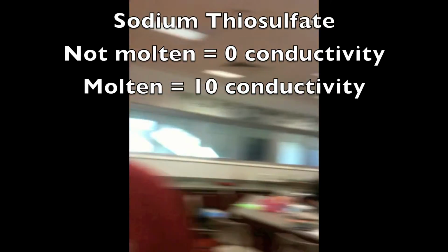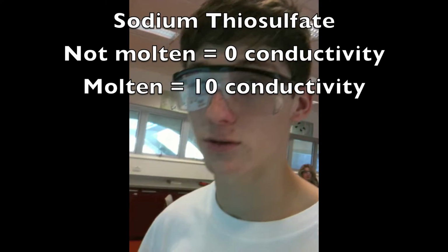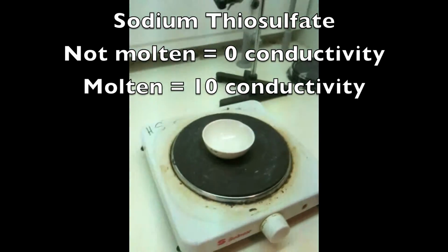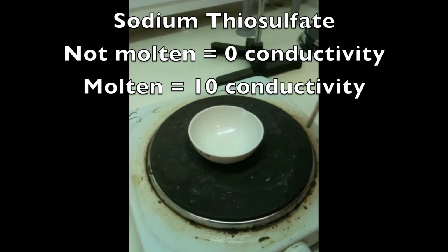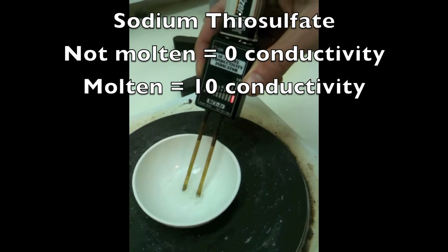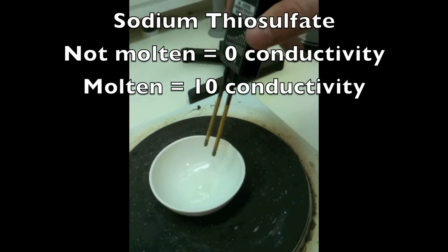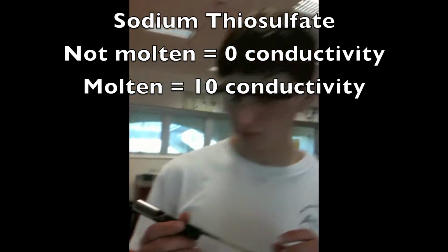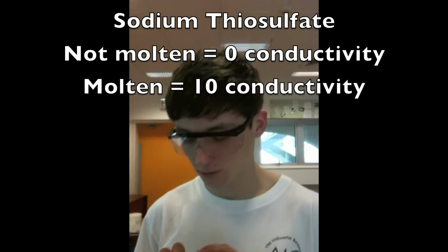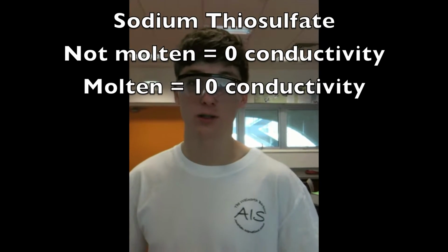Hello, we're going to now transfer over to Daniel Brudno. We're going to check the conductivity of the molten compound. Okay, press this and put it in. Correct, 10. Wash that off. Let's turn it off. Unplug it, please. The conductivity is 10, unlike when it was in its solid state and it was 0.